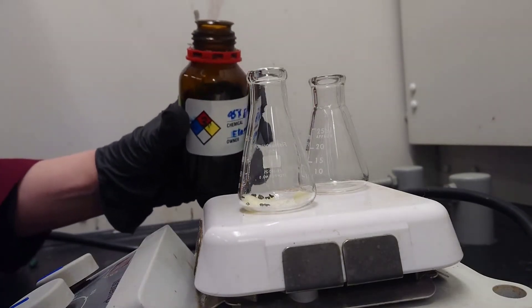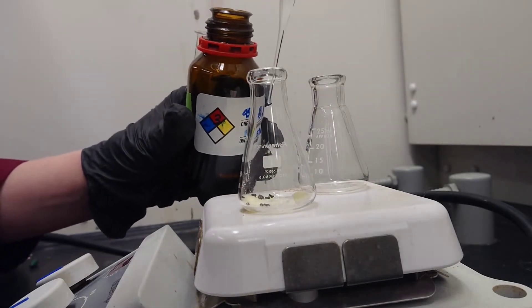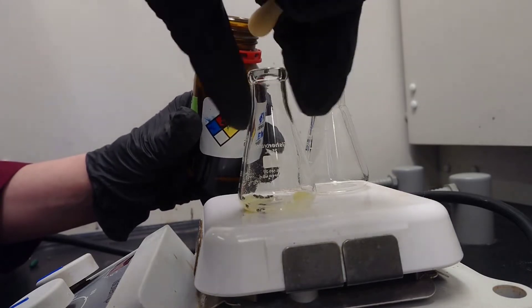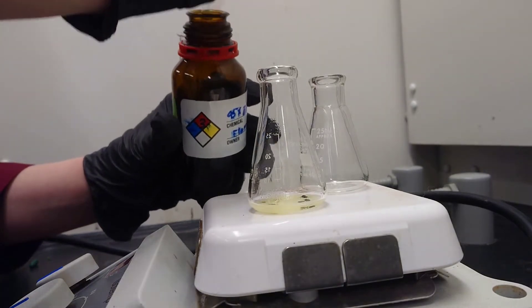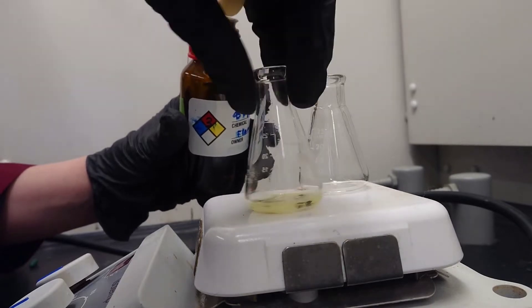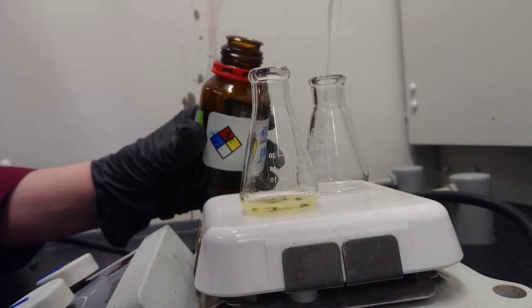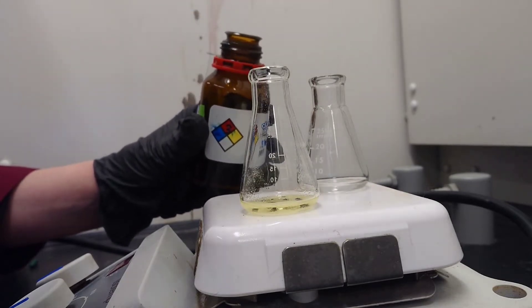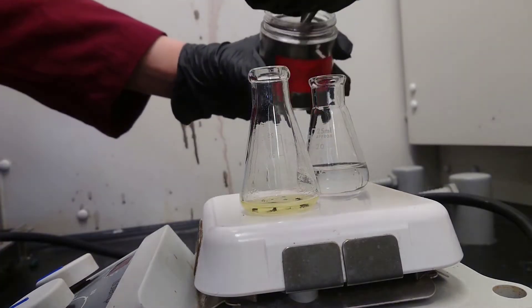Add a small amount of the recrystallization solvent to the flask containing the sample. There should be enough liquid added to cover the solid that is present. Fill a second Erlenmeyer flask with additional solvent to be heated and used during the recrystallization. A boiling chip should be added to the second flask as well.